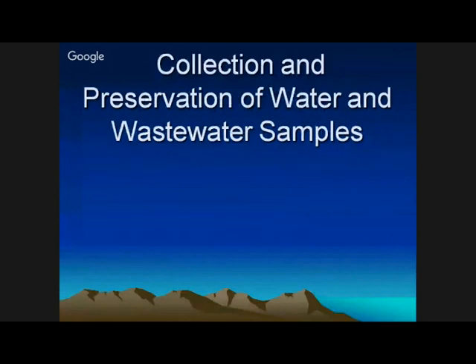Now, the importance of the collection and preservation of water and wastewater samples. Before giving the sample to the laboratory, it is very important to know how it is to be collected, how it is to be preserved, how it is to be handled, and how it goes to the laboratory. This is important because otherwise you are putting in so many efforts.